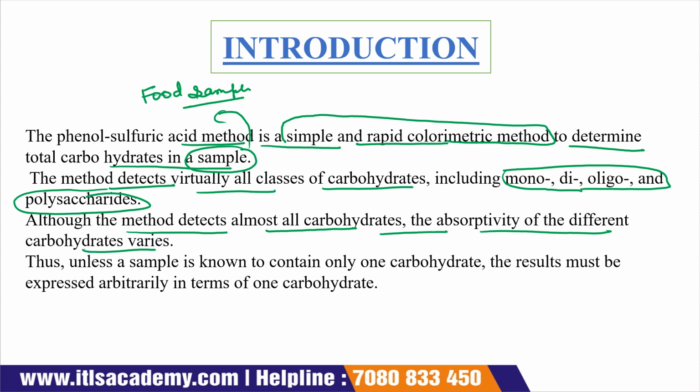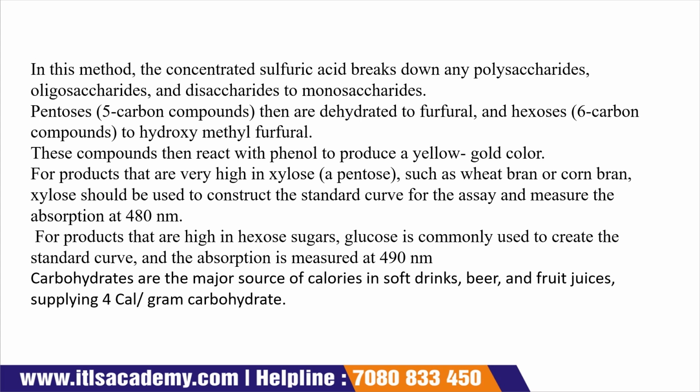When the absorptivity of the carbohydrate varies, then the result also will be different. Thus, unless a sample is known to contain only one carbohydrate, the result must be expressed arbitrarily in terms of one carbohydrate. Okay, now come to the next one.